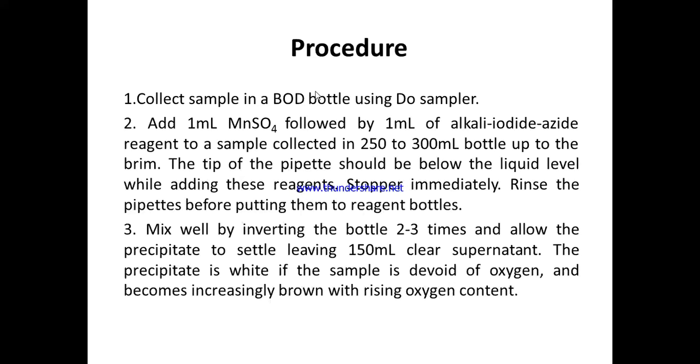तो what will be the dilution ratio? डाइल्यूशन रेशियो will be basically volume of diluted sample by volume of undiluted sample. What is the volume of diluted sample? 300 मिलीलीटर, है ना, क्योंकि हमने 300 मिलीलीटर वॉल्यूम बना दिया ना. And what is the volume of undiluted sample? That was 50 ml that we had taken.